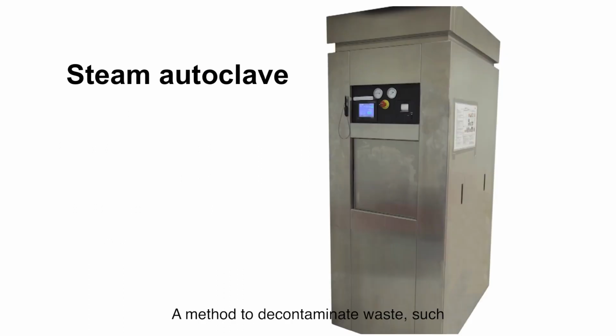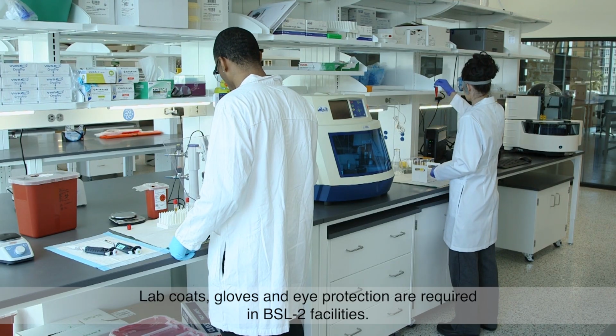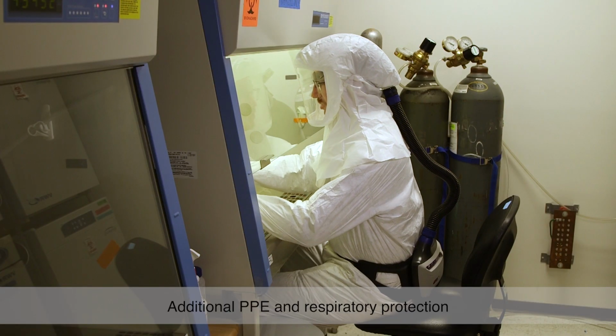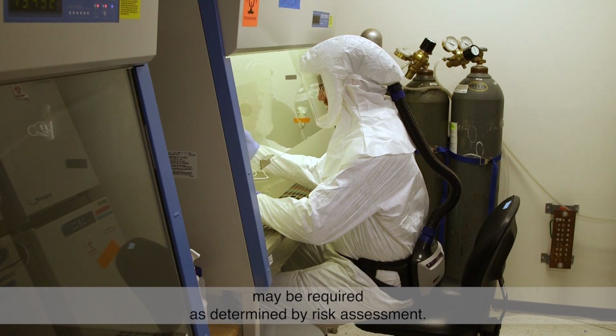A method to decontaminate waste, such as a steam autoclave, must be available. Lab coats, gloves, and eye protection are required in BSL-2 facilities. Additional PPE and respiratory protection may be required as determined by risk assessment.